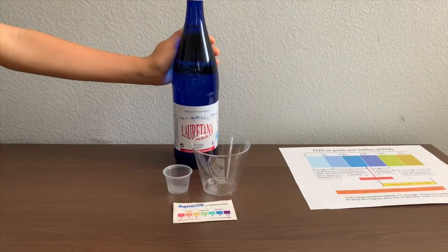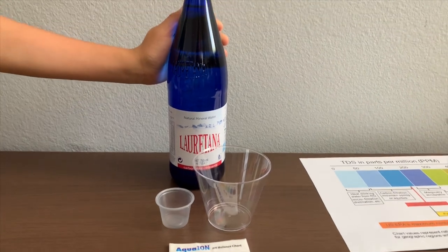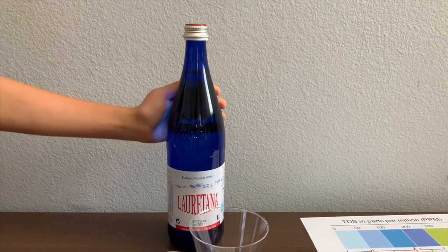This is Lauritana Natural Mineral Water from Lauritana Springs, Italy. It is carbonated, sodium-free water. Let's test the pH and TDS levels.